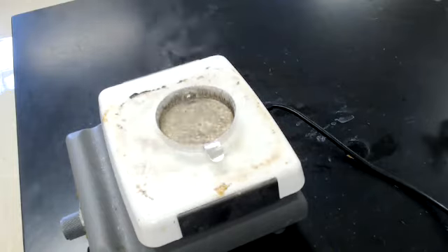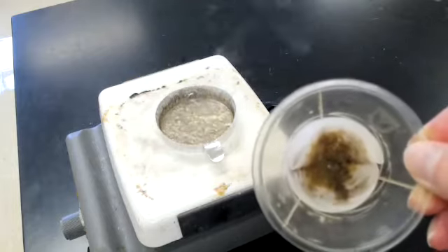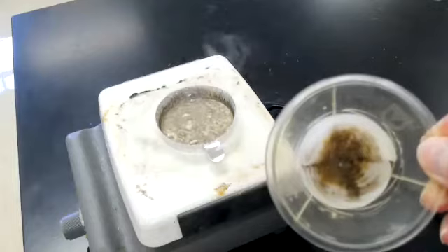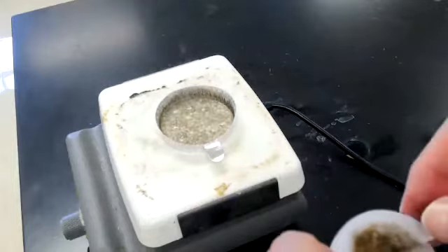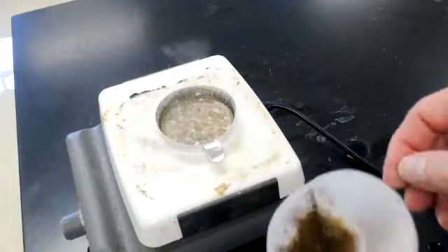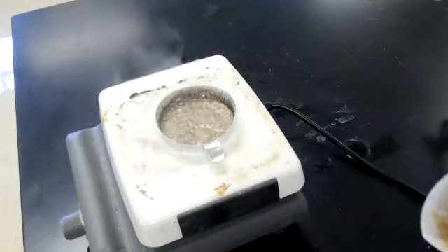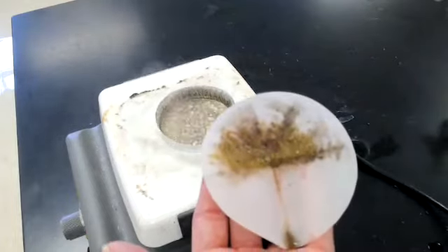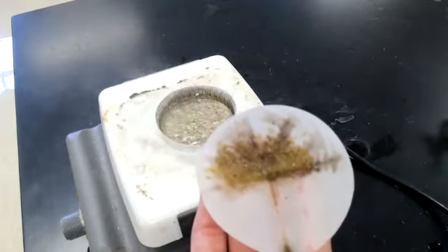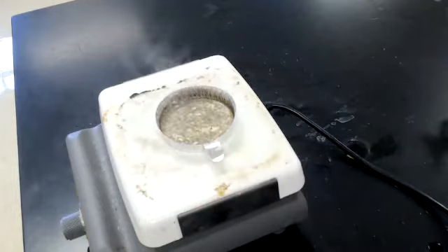Okay, now something to do for certain. I hope you already did. But while we're waiting on that to evaporate, why don't you pause and make sure you've made some observation about this filter here. So I'm going to pull it out and open it up, and you need to make some observations about what you see now. Try not to spill anything. There we go. You can make some observations about that while we wait for the evaporation to happen. So if you've not yet, be sure you pause and make observations about that.